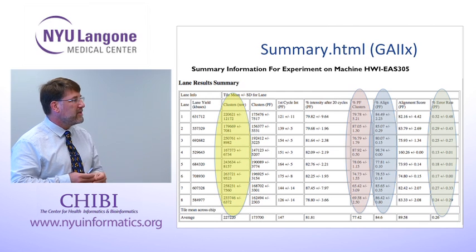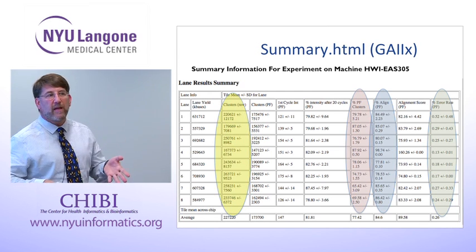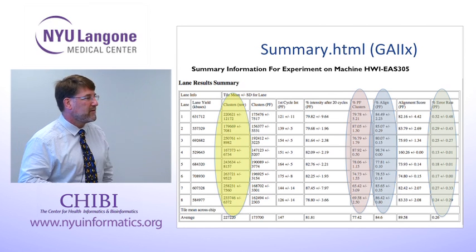Is it some unknown DNA from some other known organism? That happened to us a few times. Have you made a cloning mistake and sequenced the vector a few 100 million times? That happened to us more than once.